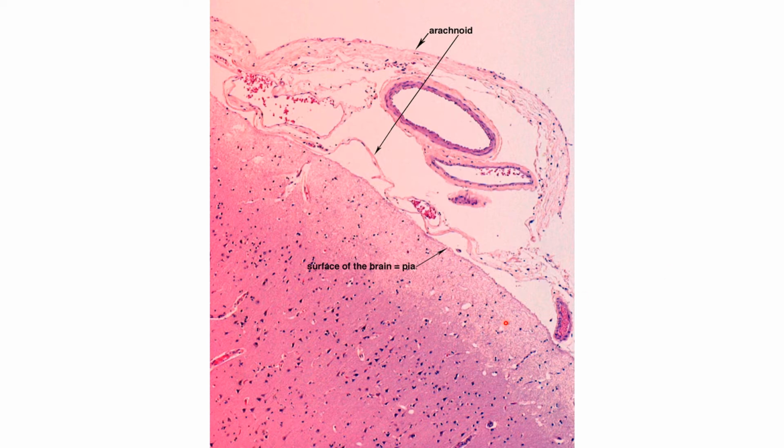Now, this is the slide of the cerebrum, which is showing the coverings. Any slide which you see, you will see the coverings of the meninges. So it is showing the arachnoid mater, and this is the pia mater, and deep to it is the external limiting membrane.